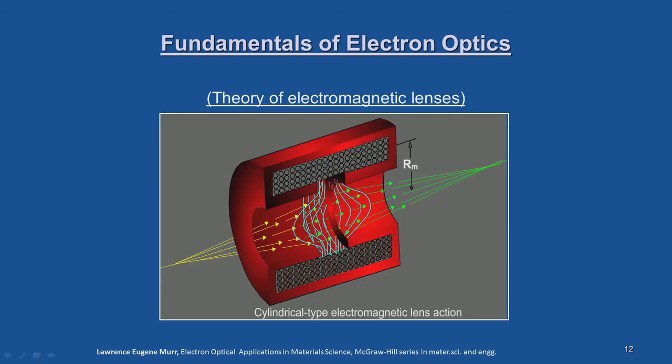You can understand the typical electromagnetic lens and the number of coils used to produce this magnetic field in this kind of slotting system is also a function of the magnetic field strength. So, henceforth in an electron microscope you are going to use only these electromagnetic lenses, instead of the optical analog we have already seen.